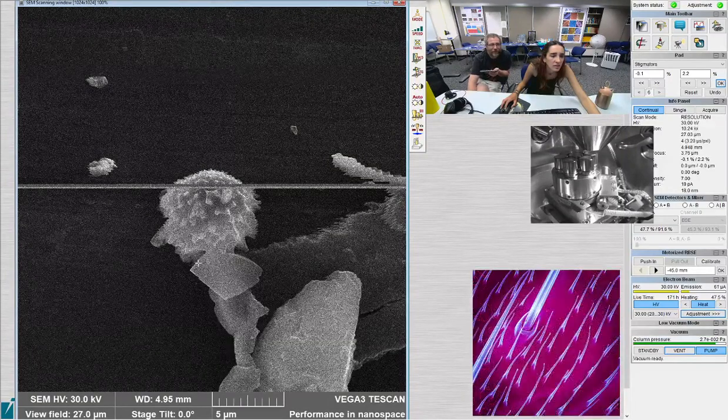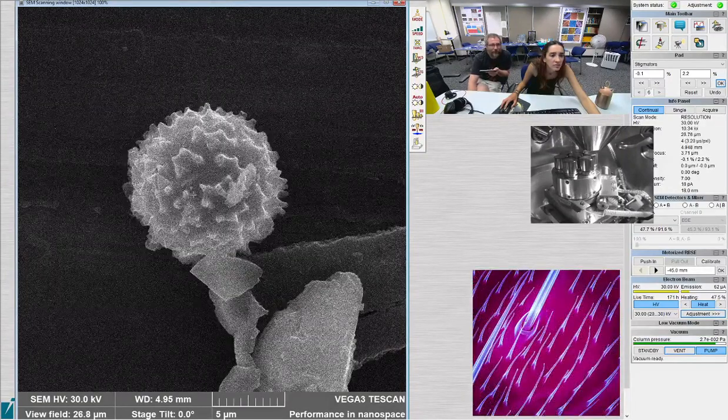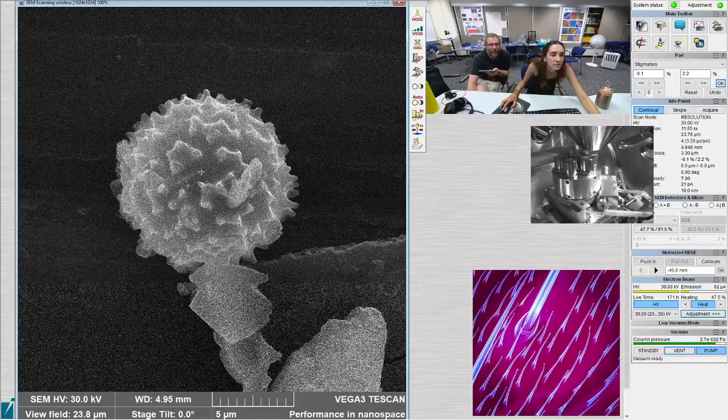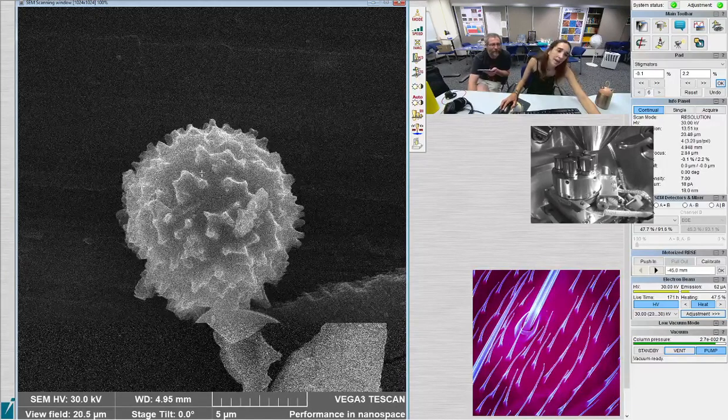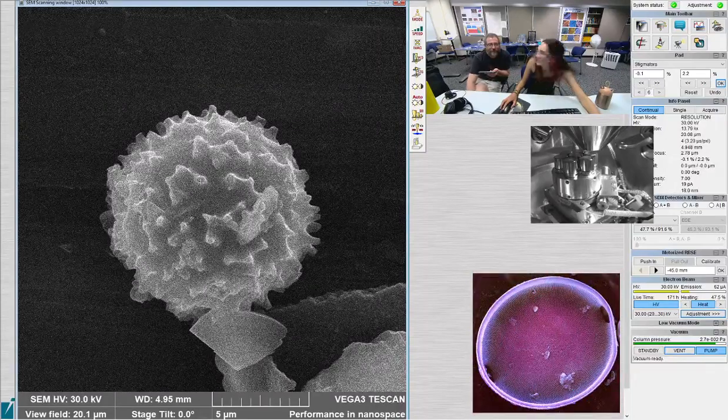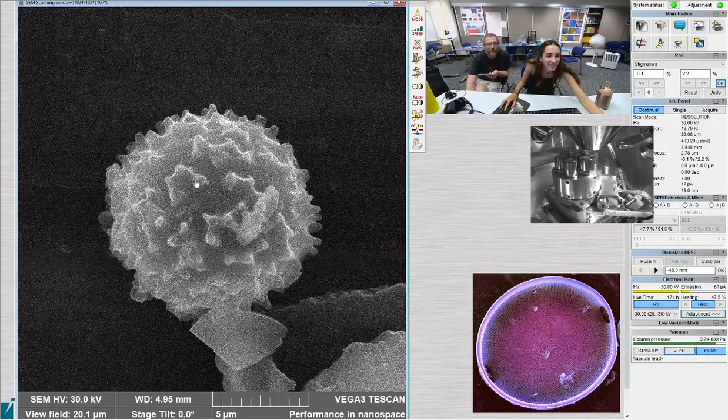Oh, it's got spines. Is it chunky spines? Oh, that's a chrysophyte for sure. Why do they all end up with their apertures out of our field of view? Would be very nice to have it facing us. You know what? There's almost no chance anybody's looked at these chrysophytes and put names or numbers on them or whatever they were going to do.